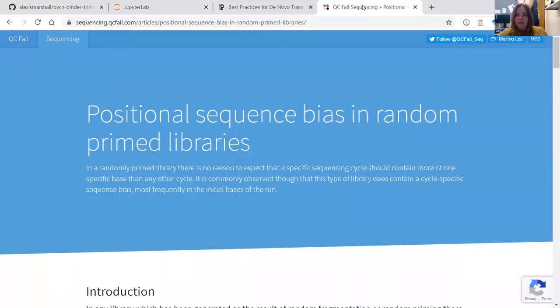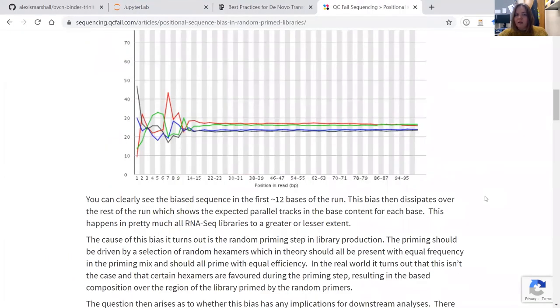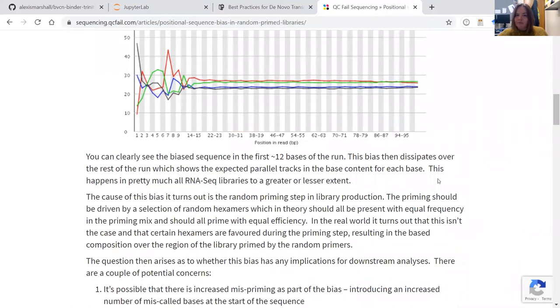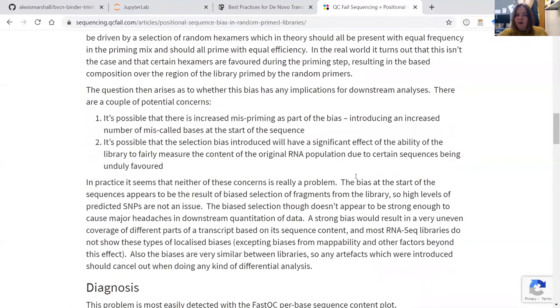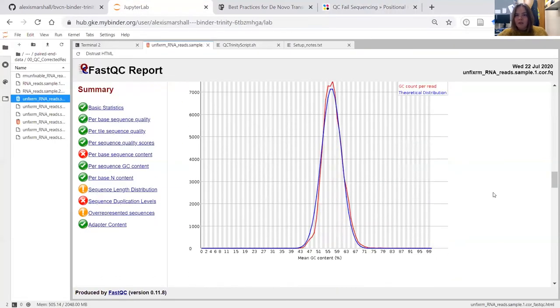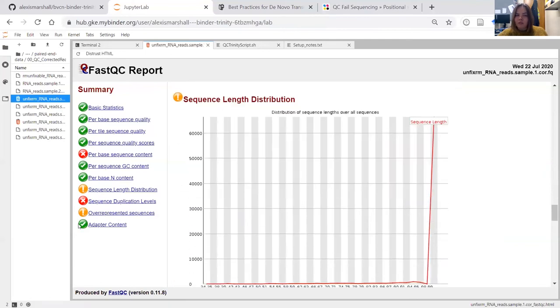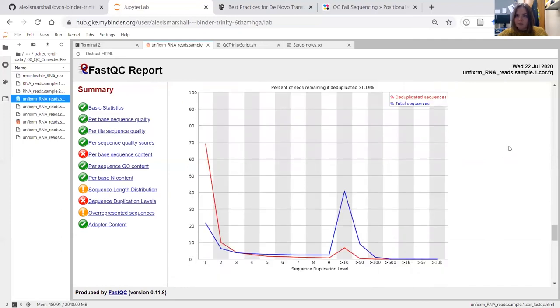There's a great blog post about positional sequencing bias that goes through this in more detail and talks about how the first 10 to 12 bases of the run have some slight bias based on random priming. Heading back, you can see the GC distribution. If you want more information on these steps and why they're passing and failing, please go to the FastQC website - they have great detail on what each of these metrics means and what you should and shouldn't be worried about for particular datasets.